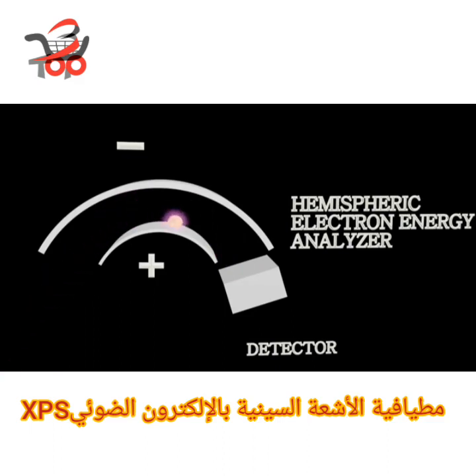If the energy of the photoelectrons is too low, then they are pulled into the inner wall and therefore they never reach the detector in order to create a signal. If the energy of the photoelectron is too high, however, then they hit the outer wall instead. If the electrical potential is just right, then the electrons can pass through the analyzer and create a signal as they hit the detector.